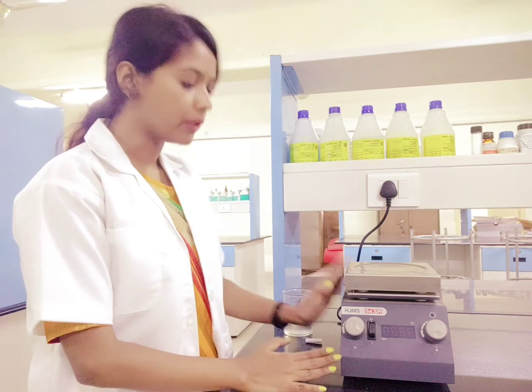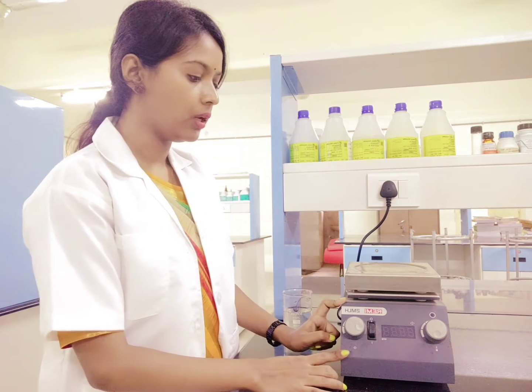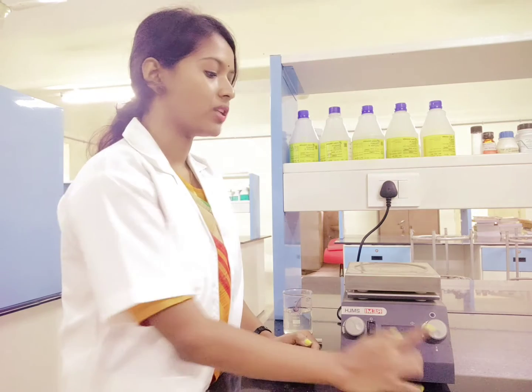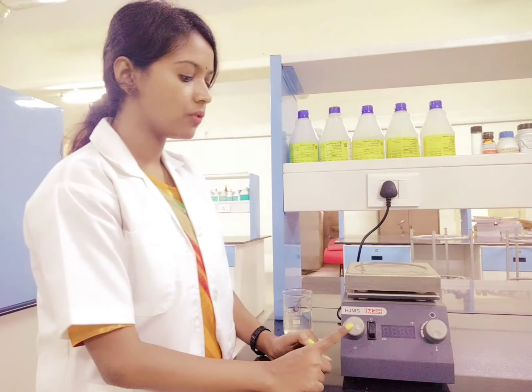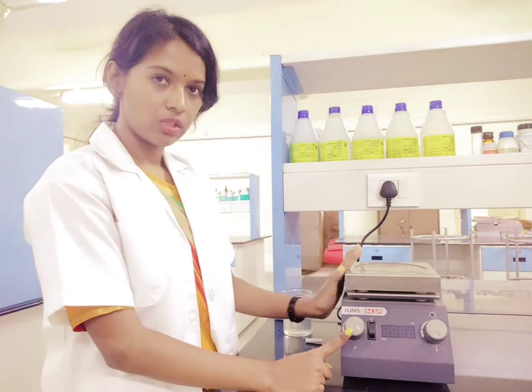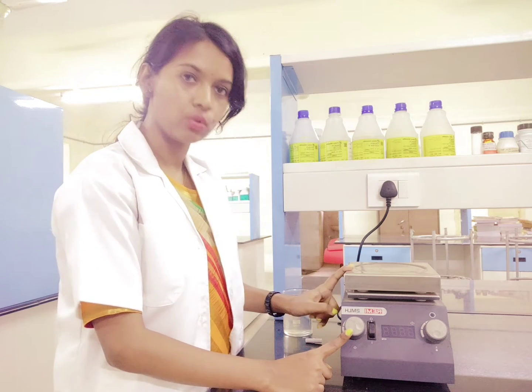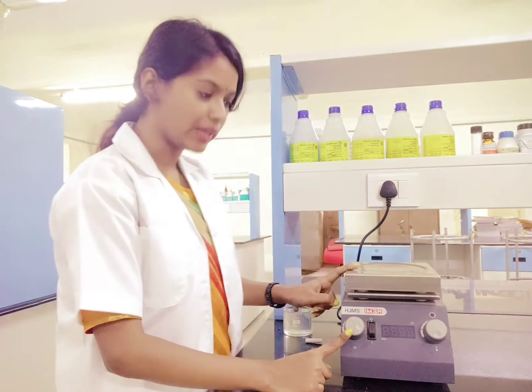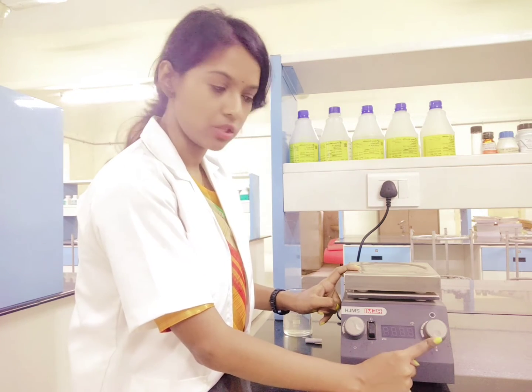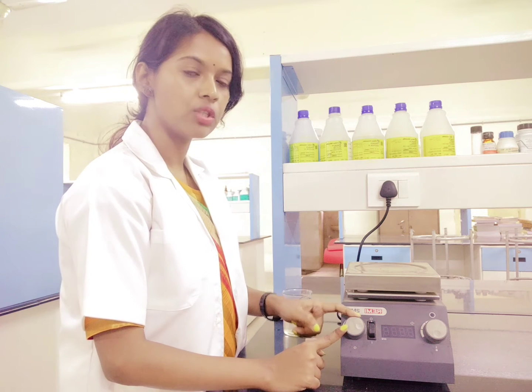Now talking about its operation, if you see the control panel you have two knobs or two regulators — one is for temperature and the other one is for increasing the speed, that is for the rotation. As the name suggests, it is a hot plate with magnetic stirrer, so it has a plate which can be heated. For that reason you have a controller which can control the temperature.